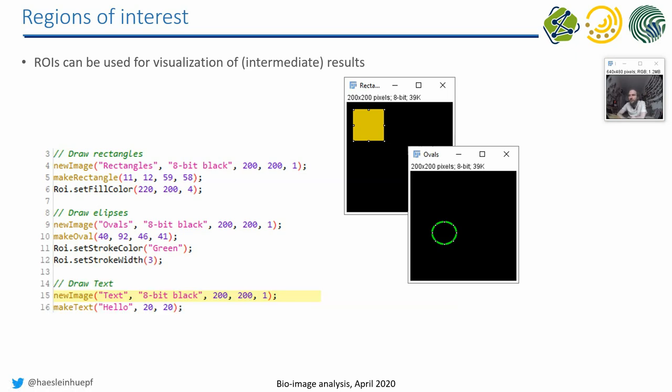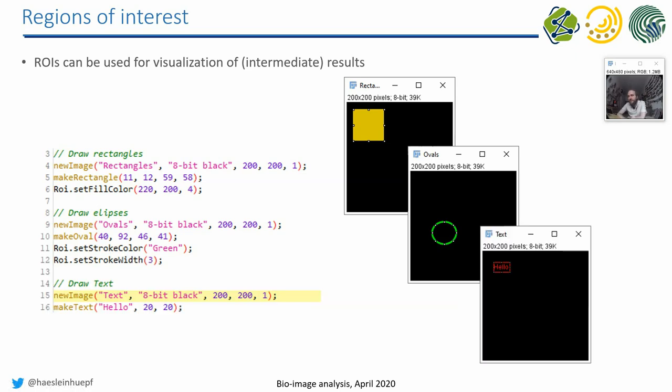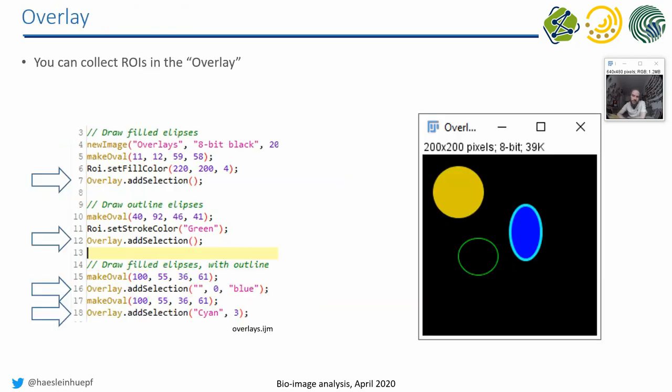Furthermore, we can also put text in images, for example, a measurement or a description of an object, a name of an object in an image.